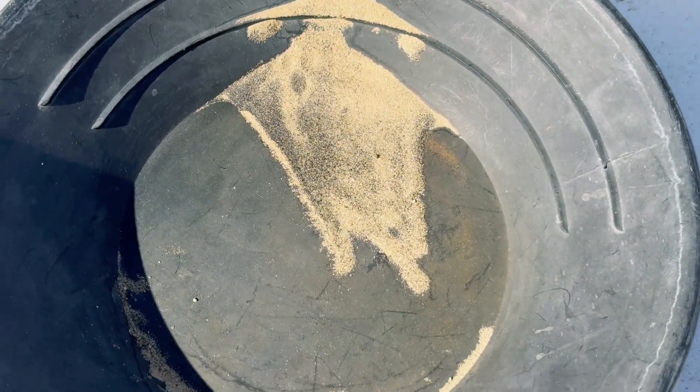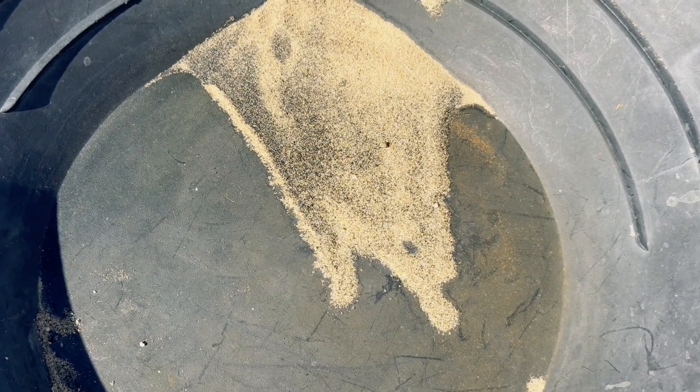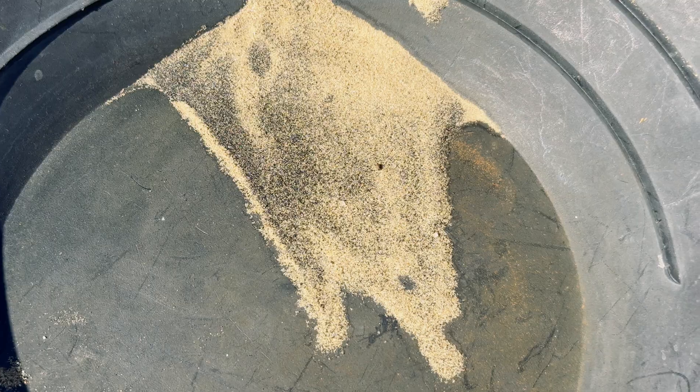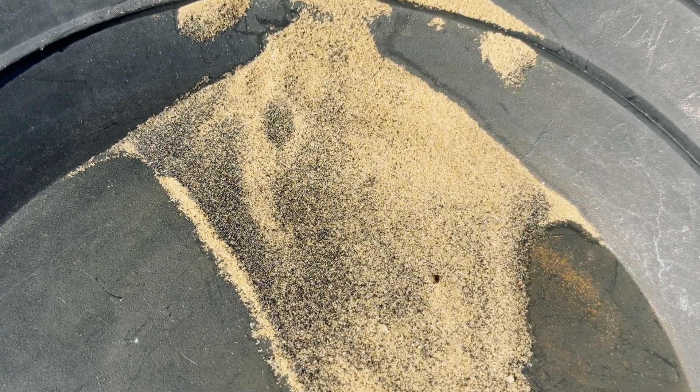I took the two sets of concentrate and combined them into this one pan. I let it dry out, and now what I am going to do is a fire assay to see if there is any gold in this concentrate.